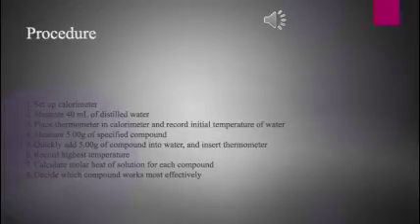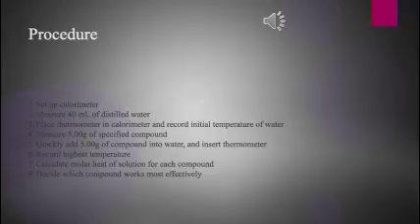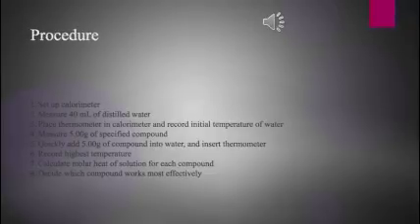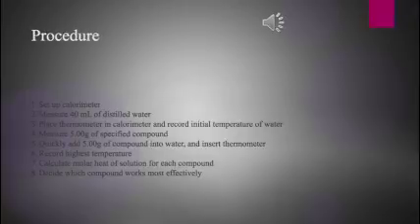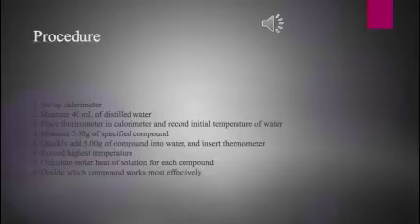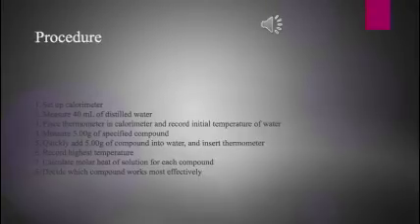6, record the highest temperature, and 7, calculate the molar heat of solution for each compound. Finally, decide which compound works most efficiently and most cost-effectively. This procedure was used for all 6 compounds. However, in between each trial, every material used was rinsed with distilled water.